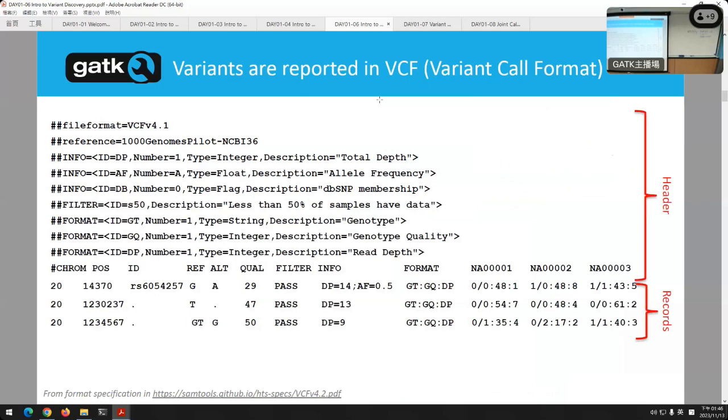Someone had asked about how we represent variants. So here's the answer. We will go into this in more detail later. I think Aaron's going to cover some of this also, so I'm just going to keep it high level. There's always a header section. The VCF is the variant call format. I'm actually an author for this format. Don't hold it against me.